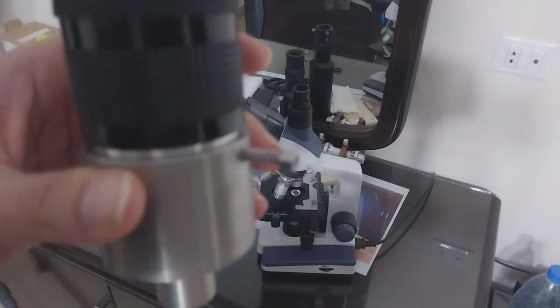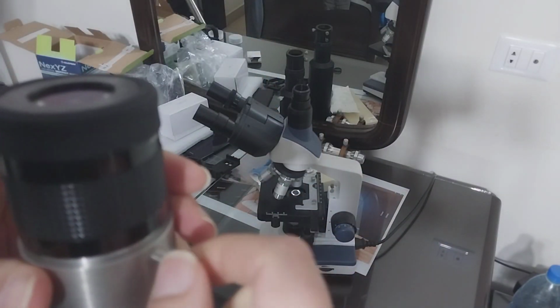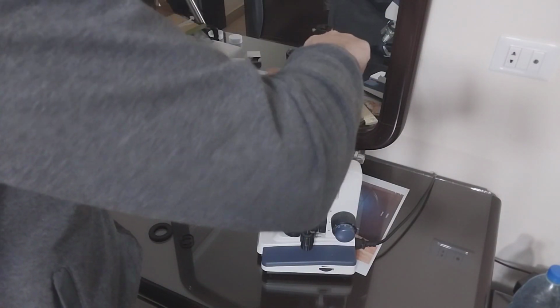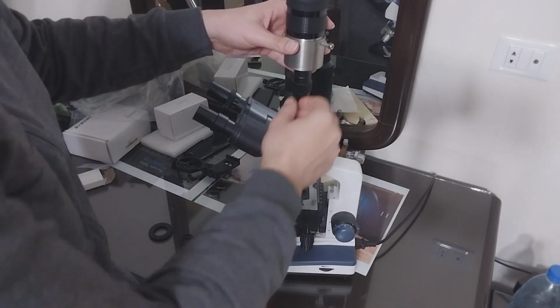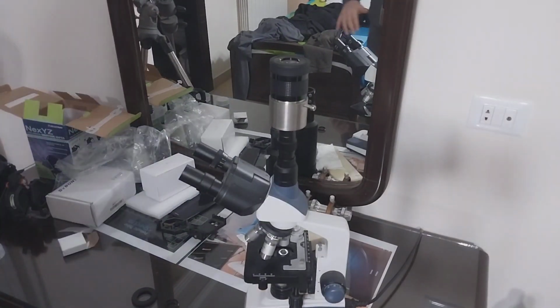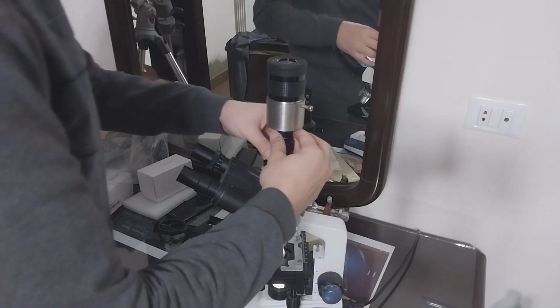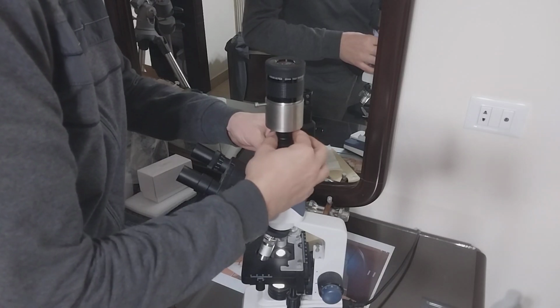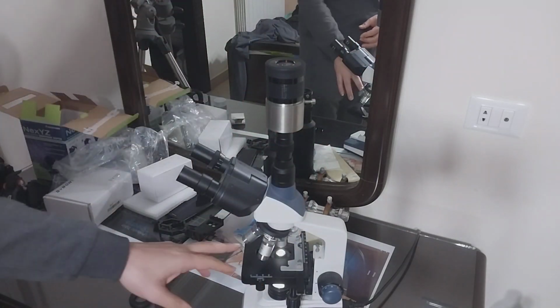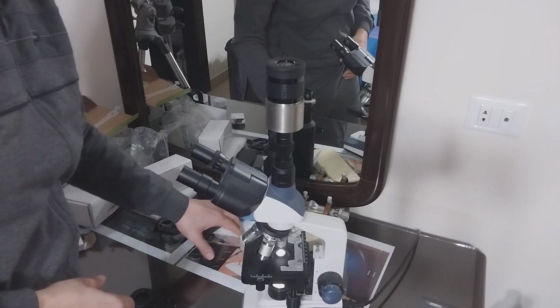I think it should be a little bit even. Oh, it's okay. Yeah, widened, okay. And then like this. So it will be like this in the end. And then you can see whatever you want to see inside the microscope. I can install it completely. There's nothing installed here, like any sample.